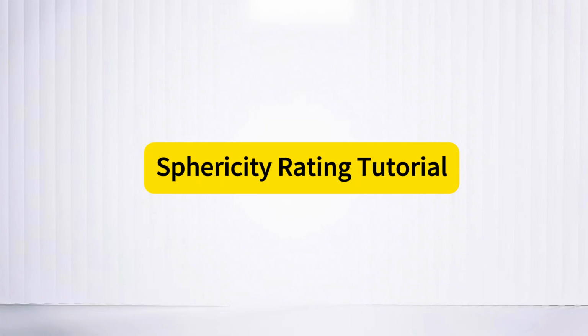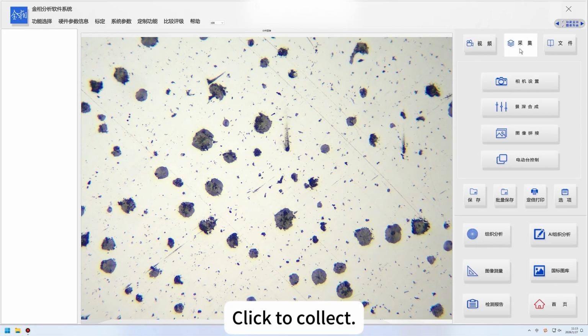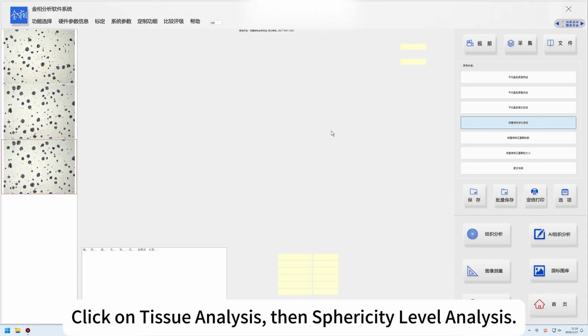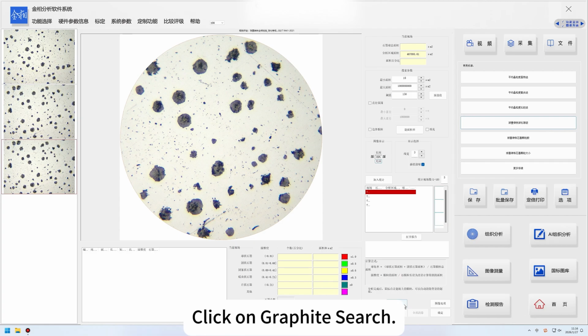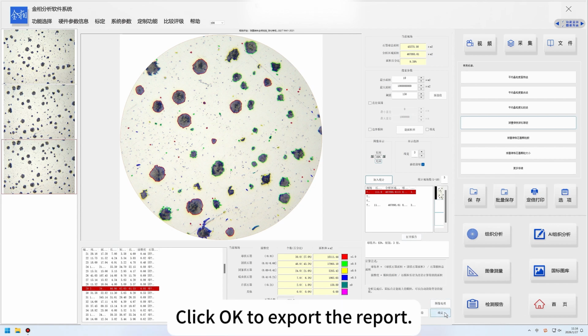Sphericity Rating Tutorial. Click Video. Click to collect. Click on Tissue Analysis, then Sphericity Level Analysis. Click on Graphite Search. Click to join statistics. Click OK to export the report.